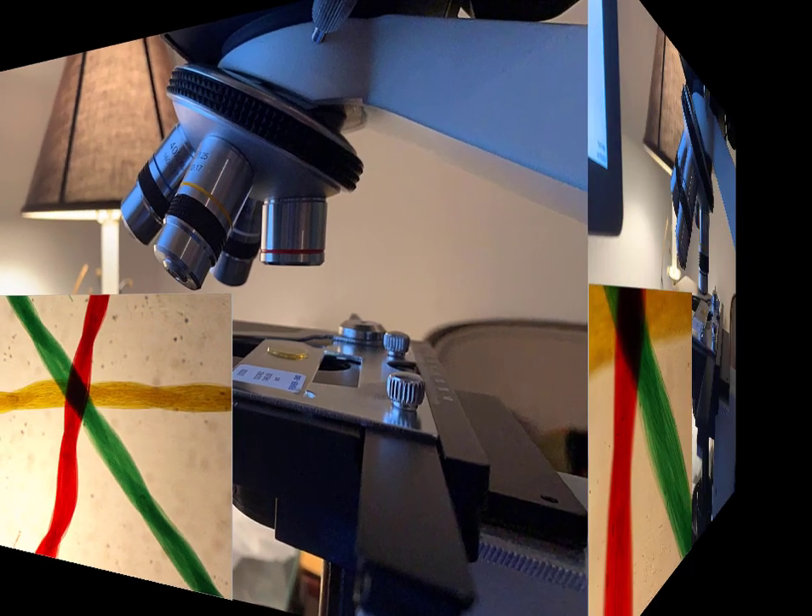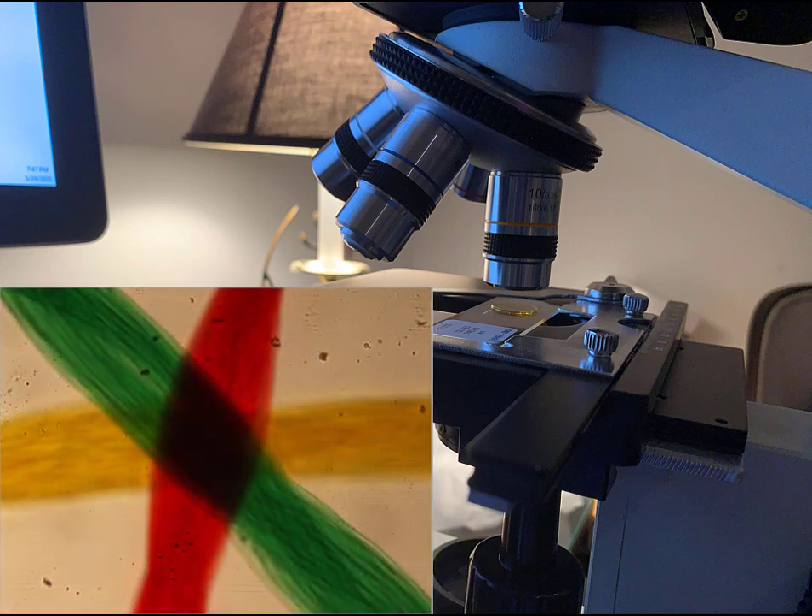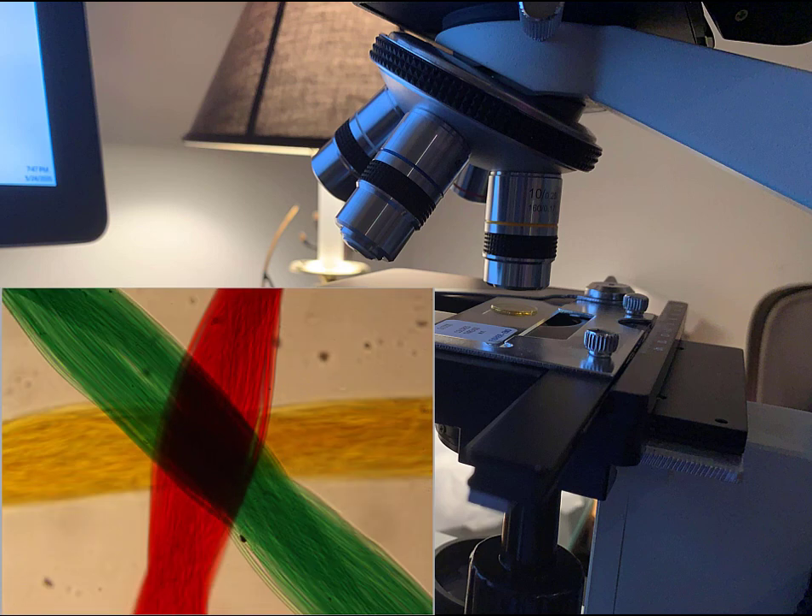Now we're ready to move on to our low power objective. We notice that the subject is no longer centered over the substage light, so this is where we use our stage control knobs to recenter it so that the objective is in the middle of our field of view. With that done, we can start to pay a little bit more attention to our focus. We notice that no part of the image is really in focus, so we'll want to focus on each individual thread one at a time by changing our plane of focus using the fine focus knobs. First, let's bring our top thread into focus — it turns out it's the green one, while the red and the yellow are a little bit blurry.